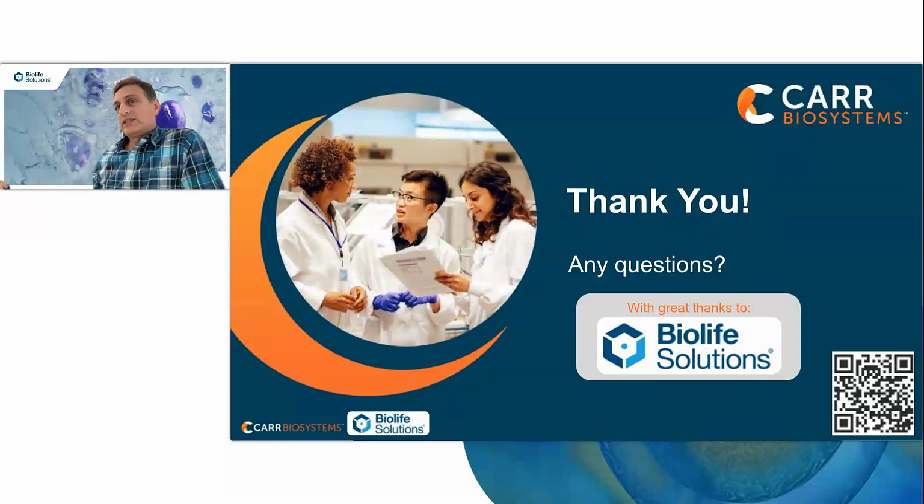One of the major concerns for use of BioLife Solutions buffers with CryoStor is the viscosity of the formulation and whether you can do wash or reformulation in any of these buffers. One thing we were trying to do in this study was to generate a little bit of data around this. Even if you don't do a wash in these, one thing that is possible is to elute the final product in either CryoStor base or CS5, and the use of CS5, or in this case CS10.